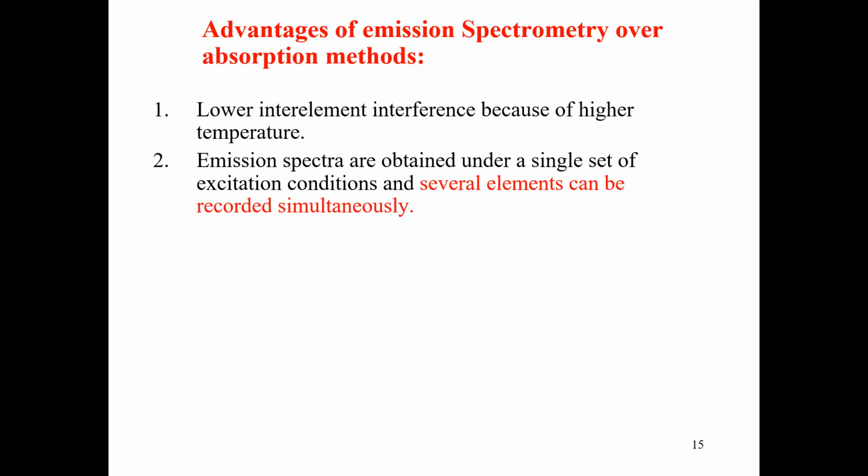Unless you have many samples. For example, if I have 60 samples, then it can take 2 hours, which means 3 minutes per element. Something in that range. So multi-elements can be analyzed from very small samples. Remember, if it's absorption methods, you have a large amount of samples.